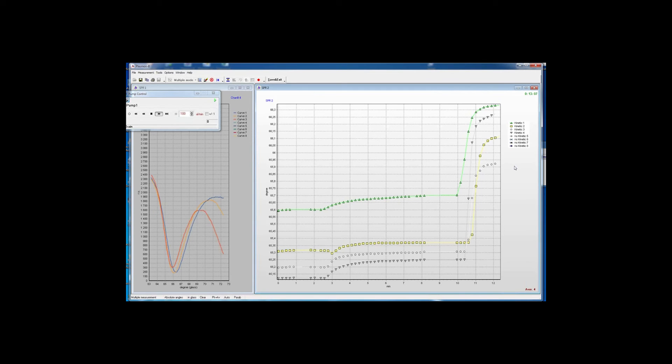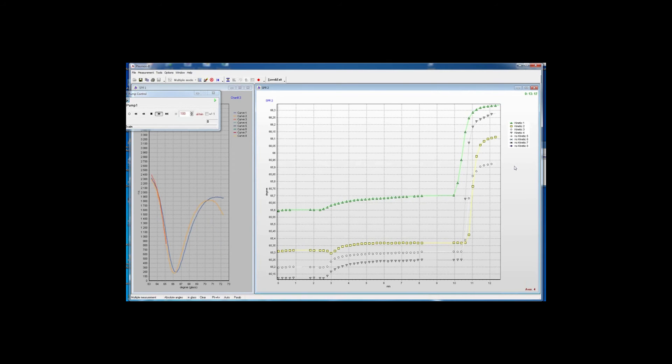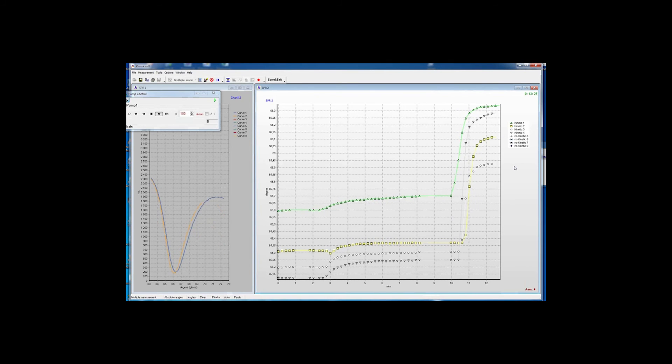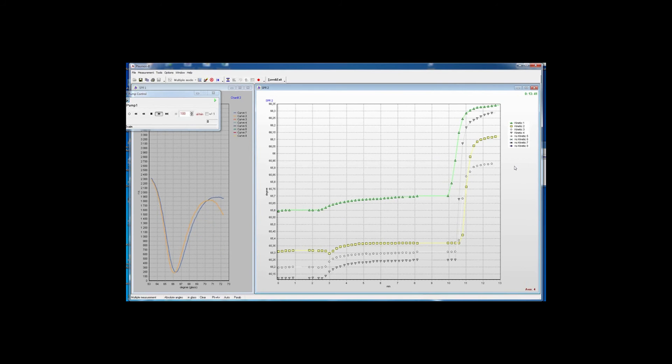In the left-up side of the screen, there is a window to control the pump. You can start or stop the pump and adjust the flow rate.